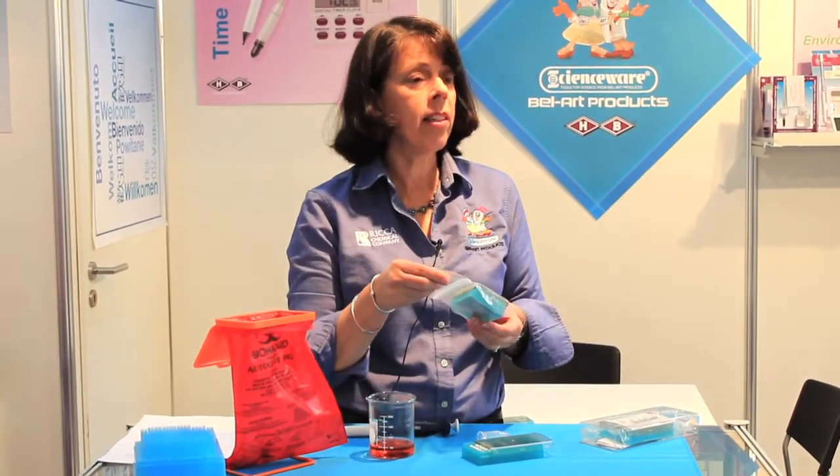FlowMes are sold pre-sterilized in trays of 50. Each tray is packed in a Ziploc bag. You can maintain the sterility by working in a laminar hood.